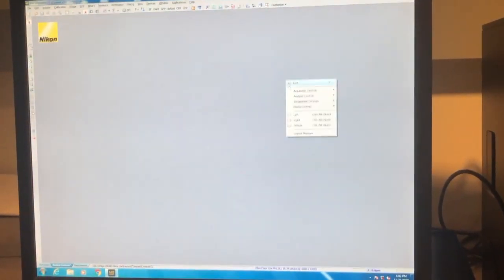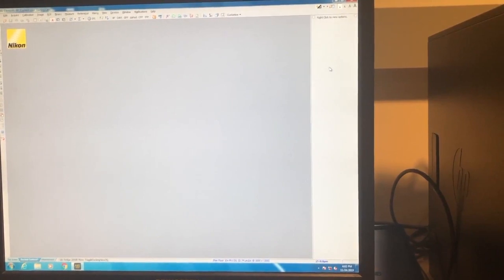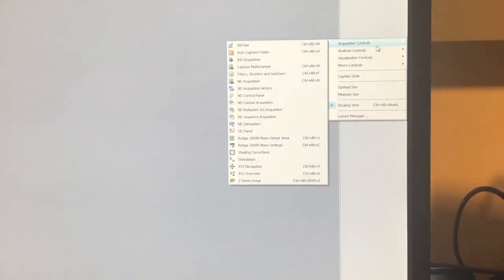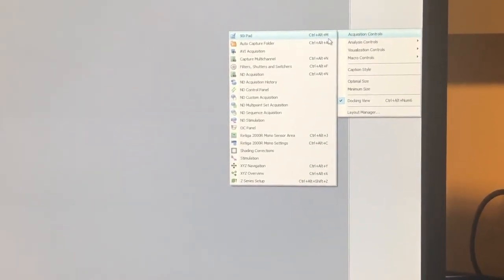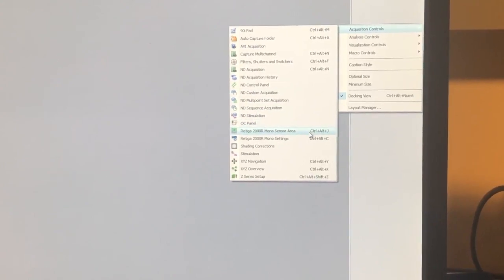Okay, so if that still doesn't work, we're going to set up the tools manually. Right-click on the gray background and go to Right to dock a panel on the right side. Then, right-click in the dock area and select Acquisition Controls. Then click Retiga 2000R Mono Settings. It's just a little down there. There it is.